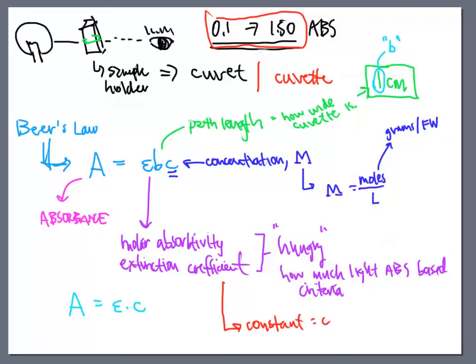But it's a constant based on each compound. So that means that it's a number that I should be pulling, and I should be putting that number into the equation. But I've got to realize what that number is in the first place, right? There are tons of compounds out there, and there are tons of molar absorptivities out there, because there really is a one number to one molecule type of relationship. All molecules have different hungriness, if that's a word, that they bring to the table.